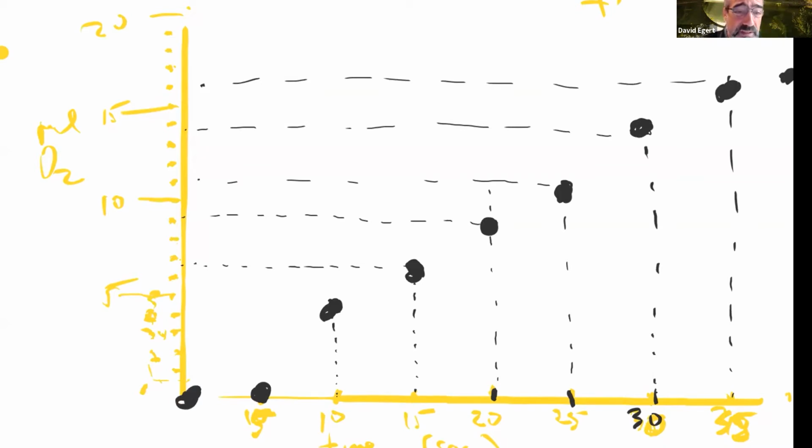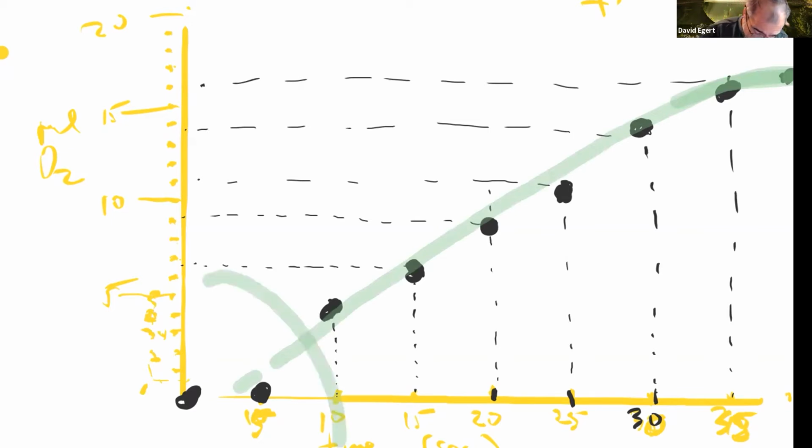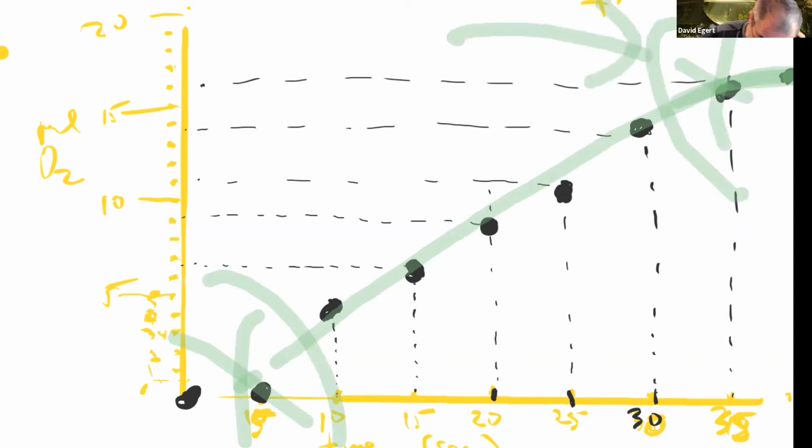What you need to do is think about what is the broad form of this thing. I'm going to take maybe a green. It's kind of going up, and then it starts flattening out. When you think about where to get the slope, this is the trickiest part. The slope is not going to be here because that's where we have that weird bubble that is probably messing us up. We don't want here. Here it's already pooping out.